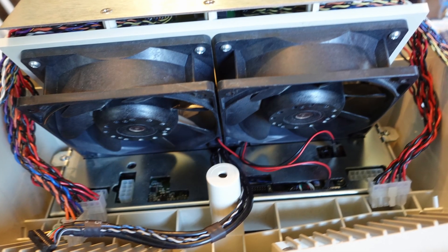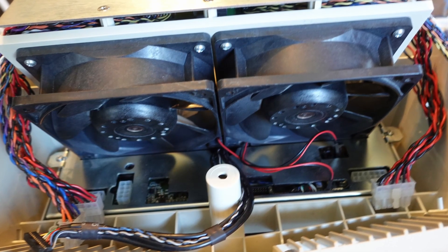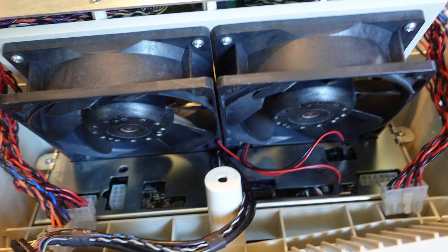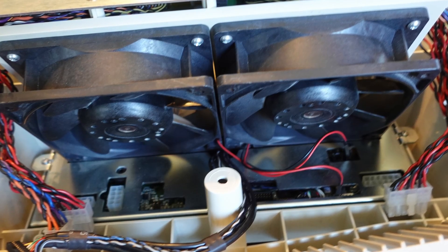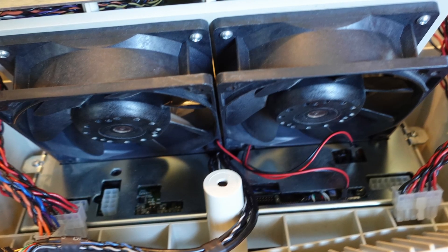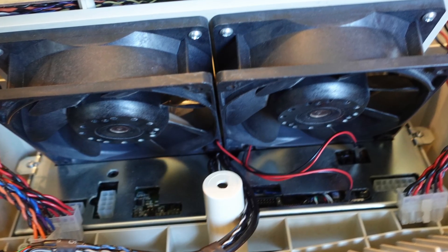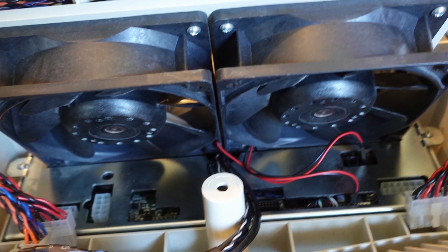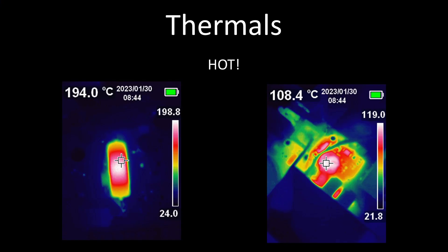Upon exploring some of the design choices in this machine, when the top section is not installed, the fans do not spin at all, meaning the power supply is started up and no air flow is moving across it. This means components can easily overheat. Also, only a tiny portion of air is allowed to make it to the power supply through tiny holes in the top of the machine. There are components at over 100 degrees C in close proximity to other components that don't like heat. This really should have its own fan if it is going to get that hot.